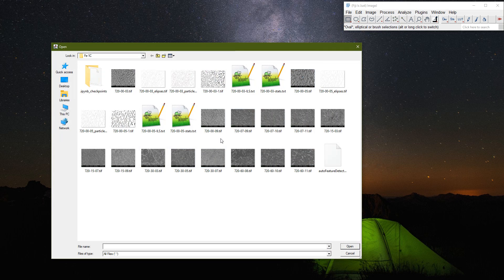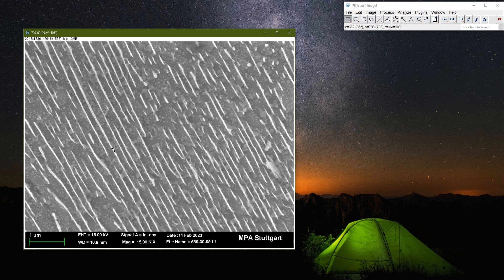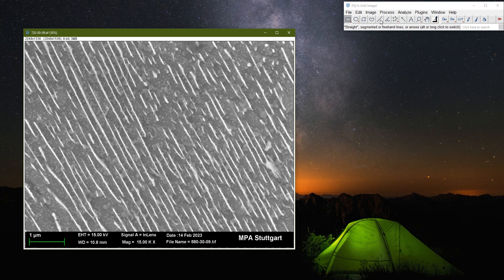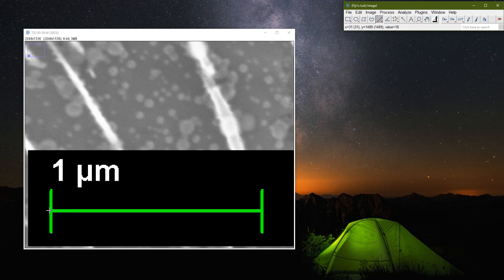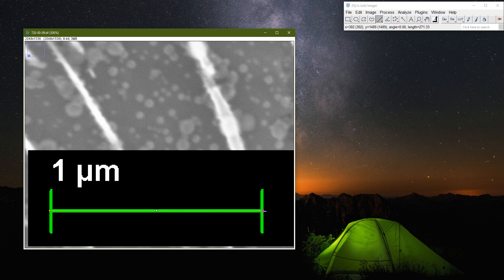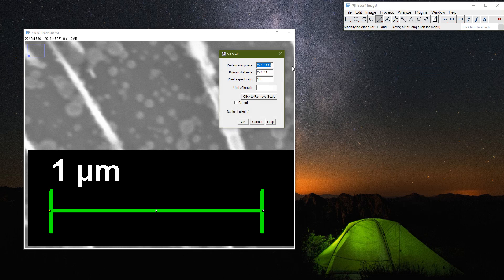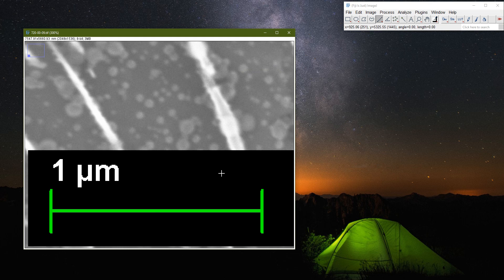I will open up my microstructure that I want to work on. The first thing I want to do is set the scale. I will select the straight line tool, press Shift and scroll in to the scale bar at the bottom of the image, then make a straight line along it. This line represents 1 micrometer or 1000 nanometers. I will click Analyze, then Set Scale, and enter the known distance as 1000 nanometers.